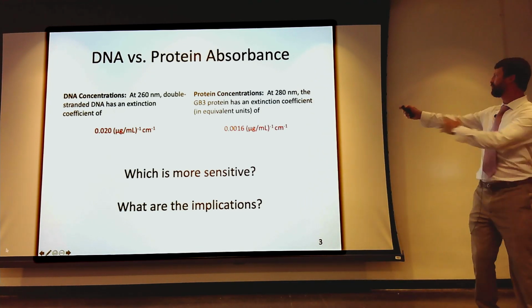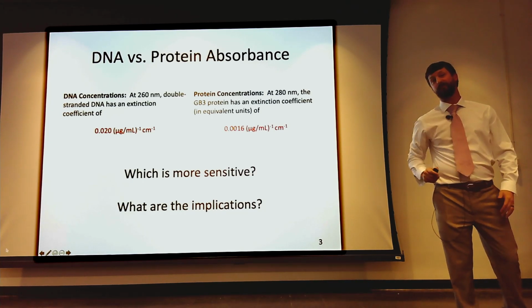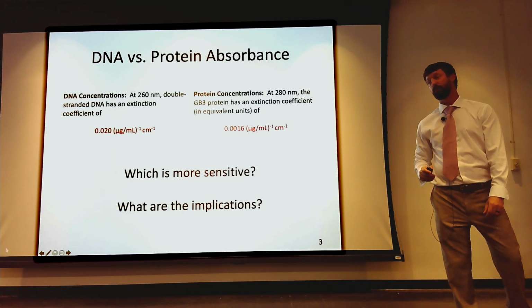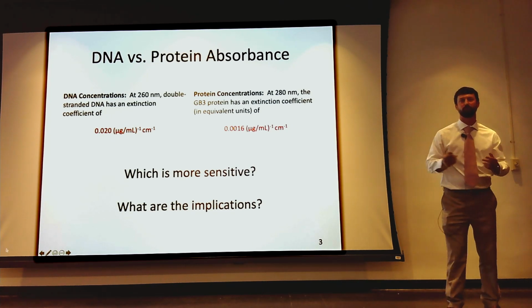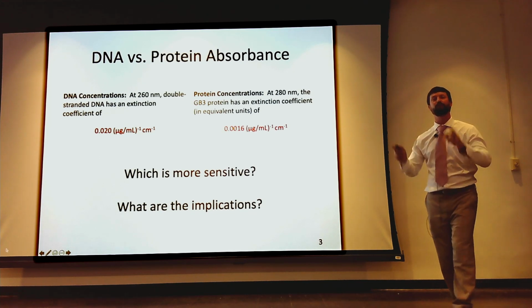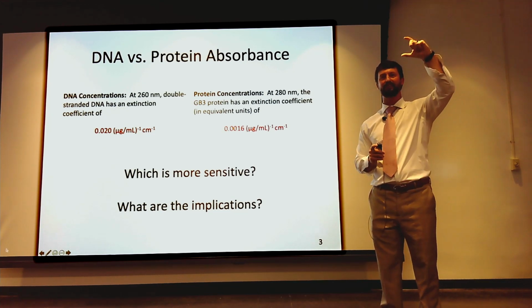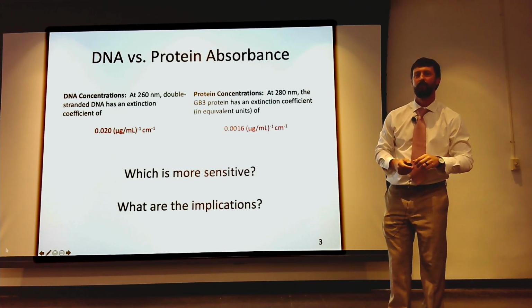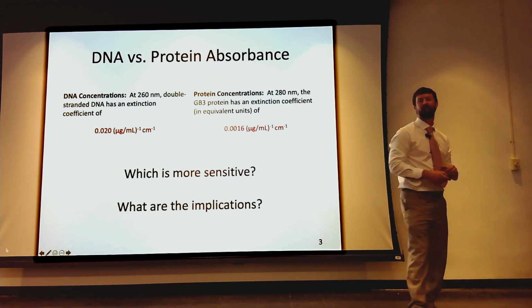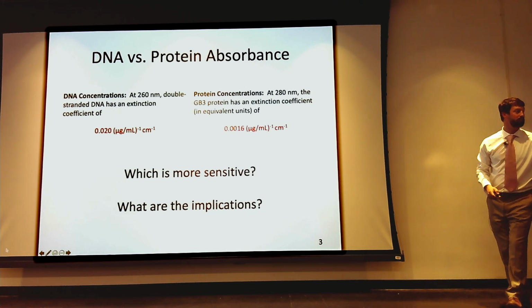So when we measure UV-vis absorbance, you need to be above 0.3. Some spectrometers cut off at 1, so you have to know your instrument. If you work with a Cary 3, you can go up to 2. If you work with a Shimadzu, they're usually at 1. It depends what you're doing. And always work, if you can, with a path length of 1 centimeter. Those tiny little black cuvettes that have the windows shaded in, use them only if necessary. Make sure you talk to your boss before you do it, right? They often have errors. Path lengths get funky, especially with air bubbles.